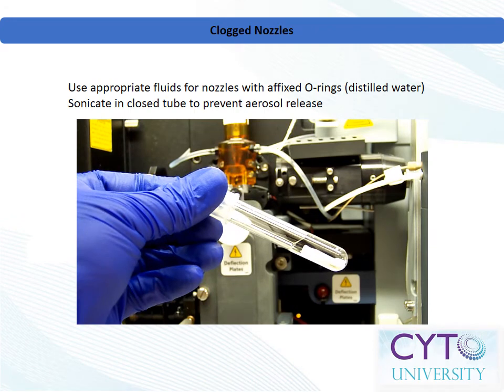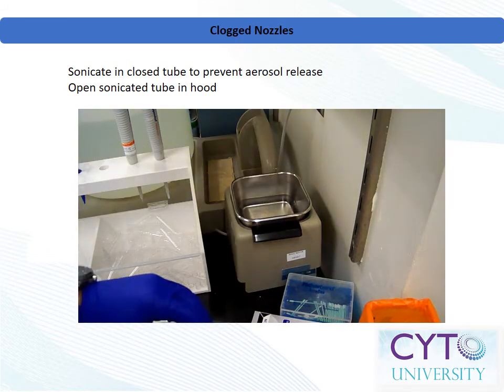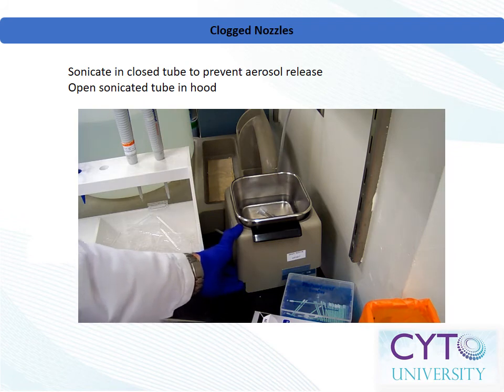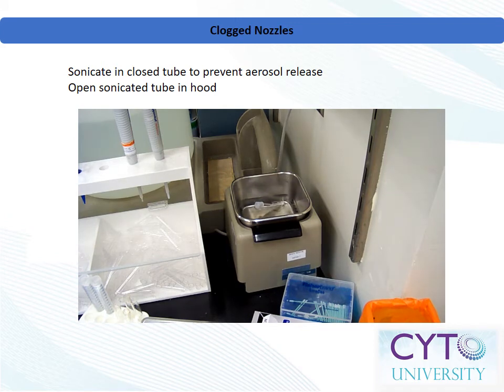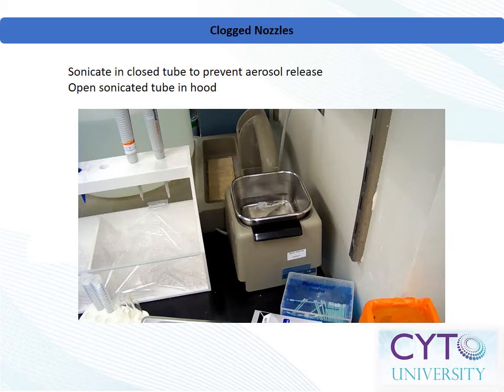Here I am using a standard 5 ml polystyrene tube for a ceramic nozzle. Fill the tube with purified water until the nozzle is completely submerged. For certain nozzles which have affixed O-rings, it is important not to use any detergents or harsh cleansers which may dissolve the nozzle's O-ring adhesive. Cap the tube and place the entire tube into a water bath sonicator. Run the sonicator for 30 seconds or longer to dissolve the clog. Remove the tube and nozzle from the water bath sonicator and follow standard operating procedure before opening the tube in order to avoid exposure to aerosols created during sonication. Drain the water and nozzle onto a lint-free absorbent wiper, inspect the nozzle's O-ring, reinsert the nozzle, and check and adjust the stream as needed.